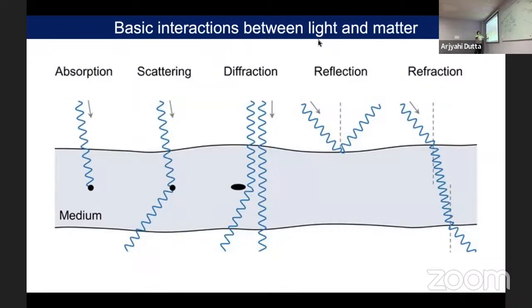In electron microscopy, most of the time we are considering scattering, because we are talking about the transmitted electron beam. And I have mentioned a couple of times that light is not damaging, but X-ray and electron are damaging. Why? Because the medium can absorb them. When there is a high energy electron, it will be absorbed and start damaging the sample. It will start damaging anybody. If it is graphene or any material science sample, or a metal like gold or silver, you cannot see that much problem. But for a soft material or a biomaterial, it is very problematic.